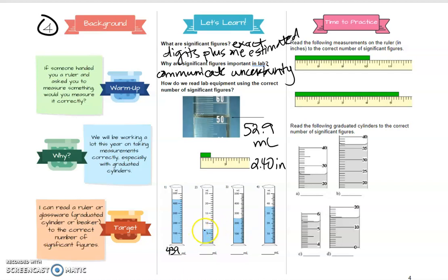So instead of 7.0, because you give me that next number, okay, it's marked to the ones place, you've got to give me that first decimal, which comes after it. So maybe you think it's 7.0, it's right on the line. Maybe you think it's 6.9, it's right below the line. Maybe you even think it's like 7.1, it's right above the line. That's where, again, you can have a little difference from the person that's next to you because you are estimating yourself.